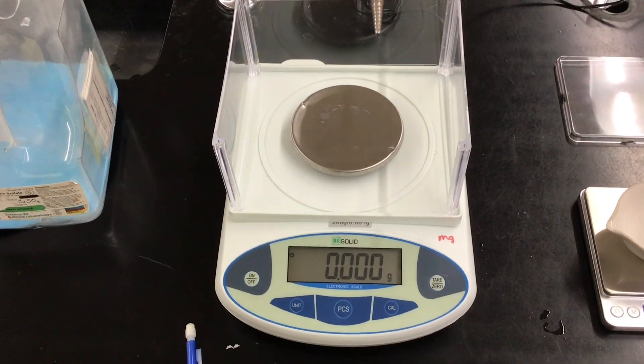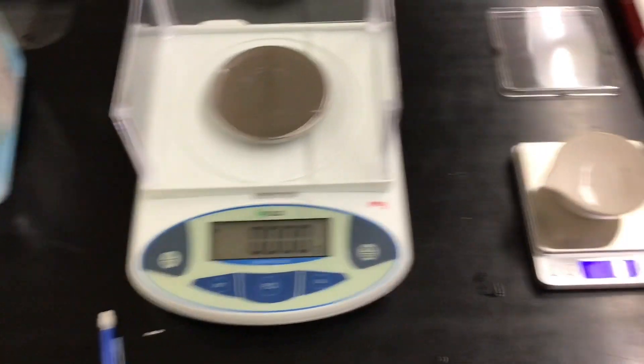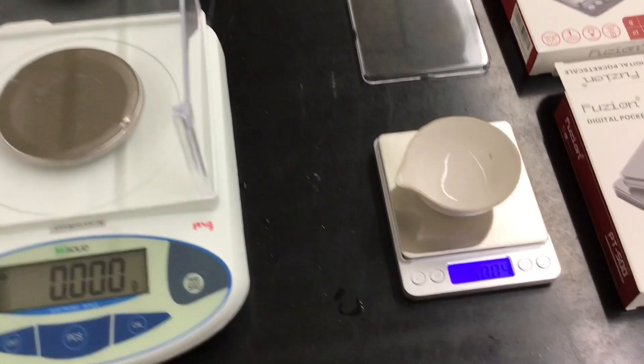For Chem 2, I'll still probably use the milligram balance when we do the KHP titration. When you measure one gram of something, you need 1.025 grams, not just 1.02 — we need four significant figures, not three, usually for the one to ten gram range.